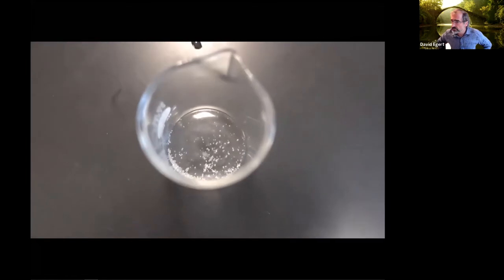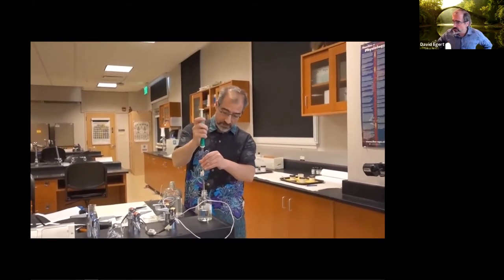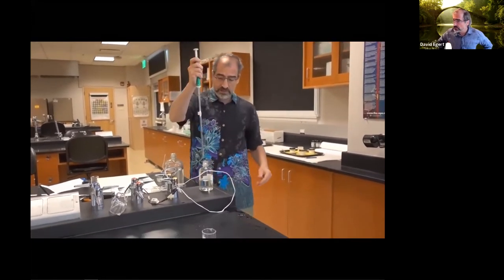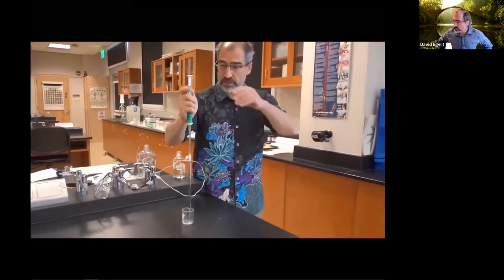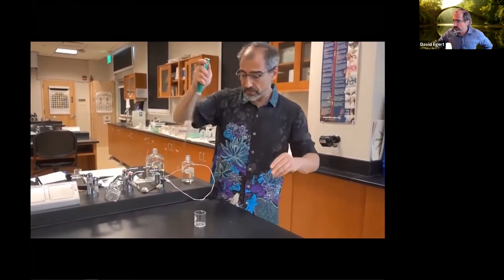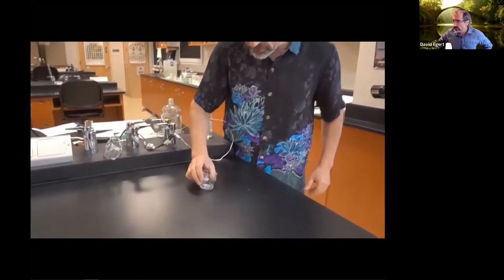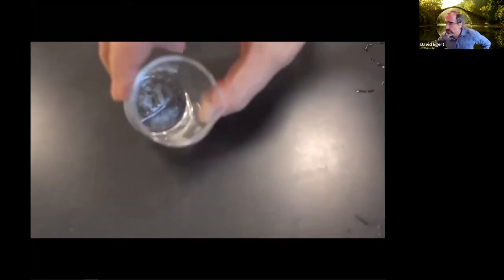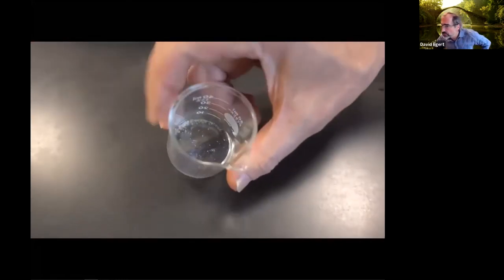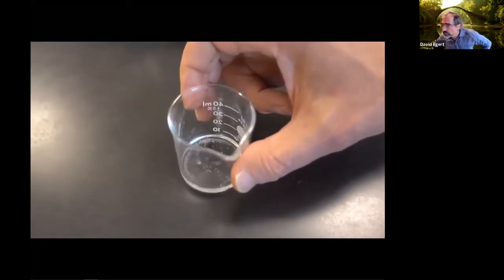And now I'm going to take the mineral oil, and I can take 5 mils of mineral oil in the same basic way. Suck up to the 0. I now have 5 mils in my tube, and then dispense. That's 5 mils of oil now in my beaker. Now I mix it up. I don't know if you can see the crystals. I don't see the crystals dissolving. I just see a bunch of crystals lying in the oil there.